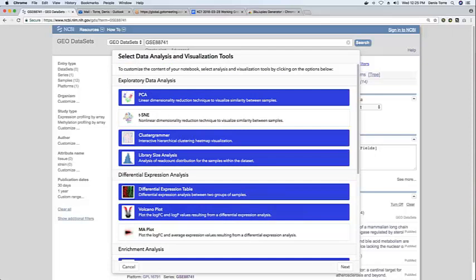So once the user has selected the amount and the specific tools that he wants to incorporate, you can then click on next.